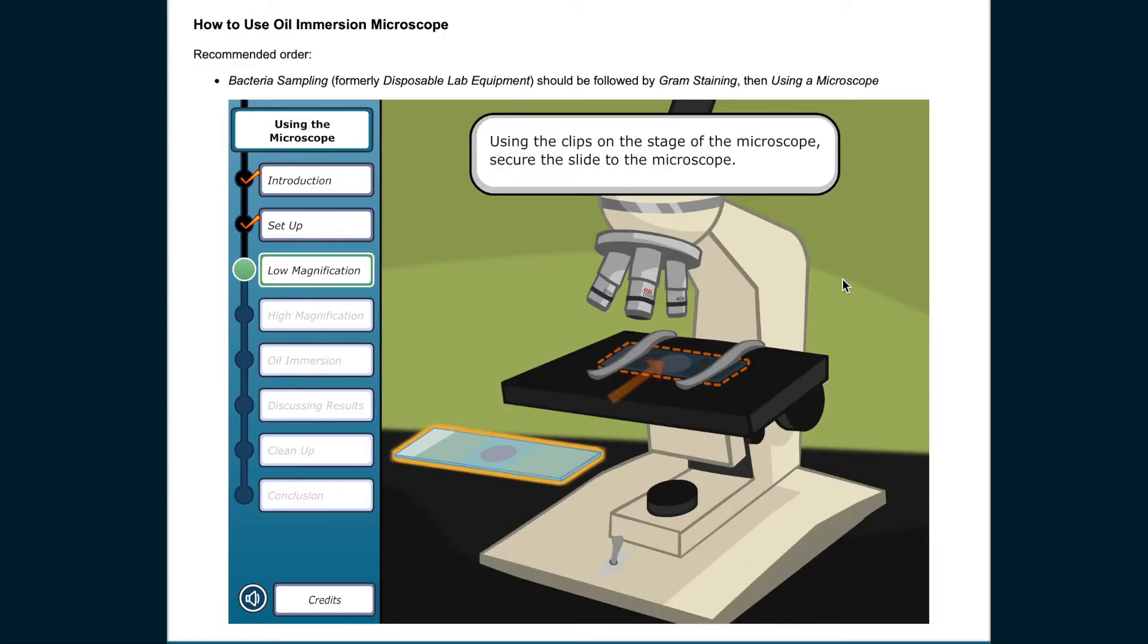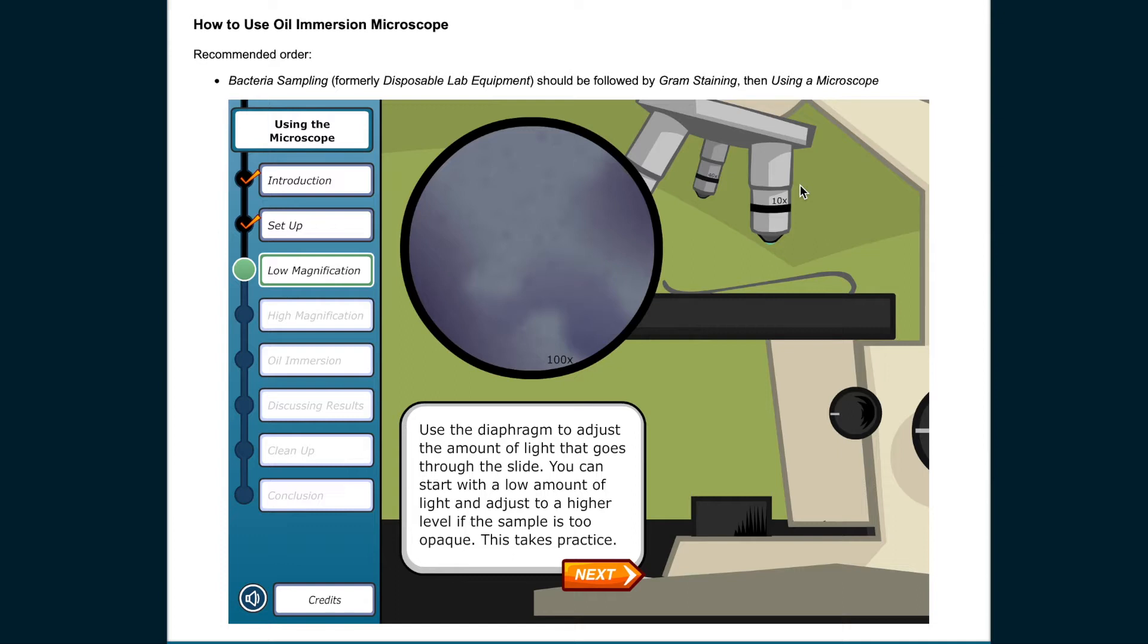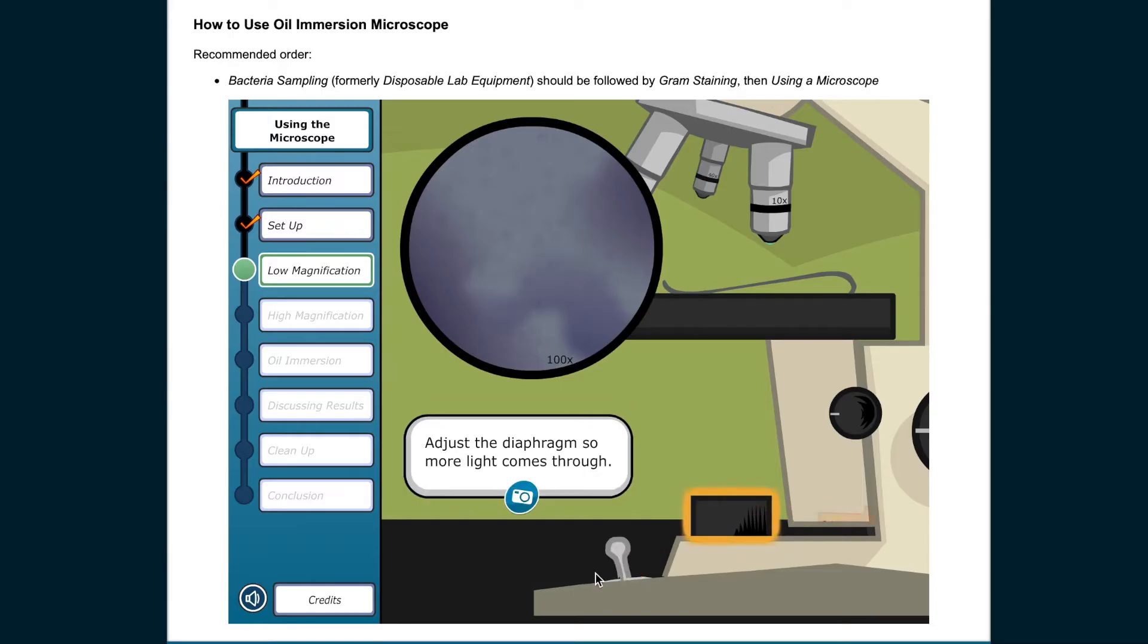Using the clips on the stage of the microscope, secure the slide to the microscope. Use the diaphragm to adjust the amount of light that goes through the slide. You can start with a low amount of light and adjust to a higher level if the sample is too opaque. This takes practice. Adjust the diaphragm so more light comes through.